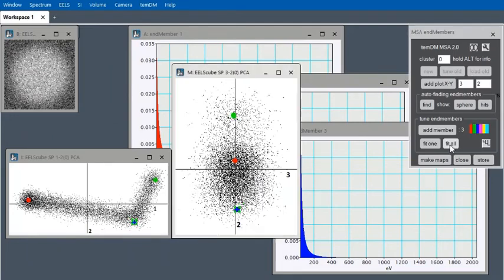We can press that several times and observe that the orientation of that line would slowly approach the direction of the second principal component. And that is the correct result because there are only two meaningful principal components in the system. I call this method also semi-automatic tune because the results are dependent on the initial conditions.